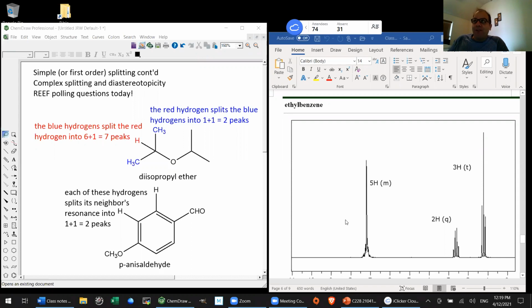Now, I've taken a fair few carbon NMR spectra in my life, and sure, I've seen cases where I'll see one peak at 101.6 and another one at 101.9, and I have to expand that region, and then I can see 2 nice sharp peaks. Yes, something like that can happen. But I don't remember a single time when 2 carbon NMR resonances fell exactly on top of one another. I almost don't think it's possible, just because the chemical shift range is so much wider in carbon NMR than in proton. But in proton, it's not all that rare.